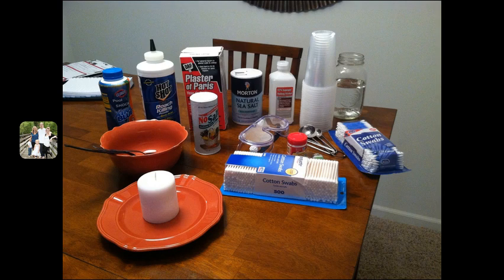The solutes used in the experiment were sodium chloride, table salt, potassium chloride, which is found in salt substitute or no salt, copper chloride, pool shock algicide treatment, boric acid, roach killer, potassium bitartrate, cream of tartar, and calcium sulfate, plaster of Paris.